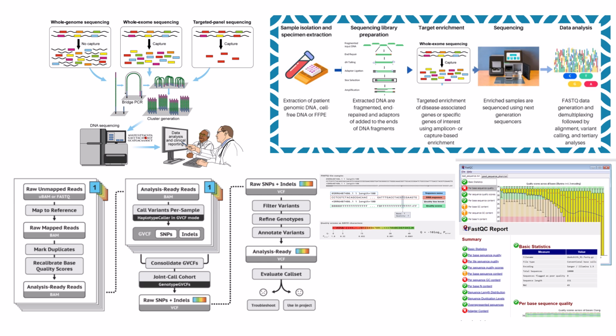And what's really striking is how much of this is automated, right? Like a complex recipe. Exactly, a sophisticated digital workflow. Often it's orchestrated by a master recipe encoded in a script, like the bash script we're looking at. Right, so this script is the engine, basically, turning all those A's, T's, C's, and G's into meaningful insights, crucial for things like inborn errors of metabolism, for example. Absolutely. So our mission today is to unpack the purpose behind each step in this automated pipeline, using the script you shared as our guide. Let's dive in. Sounds good.